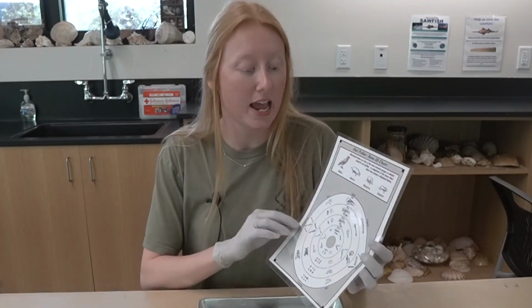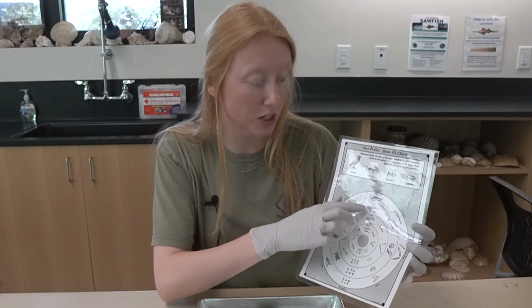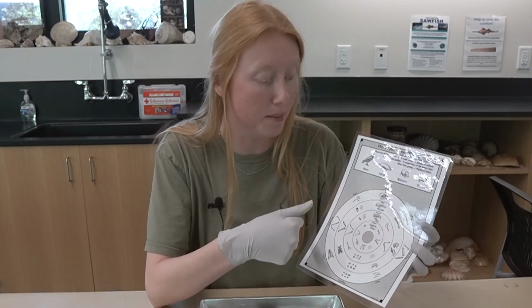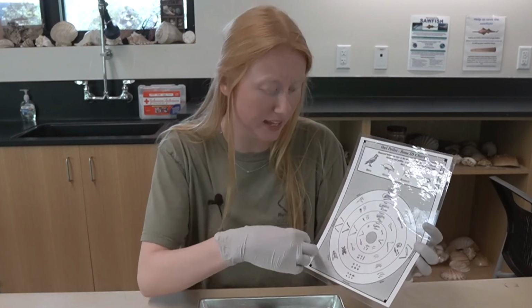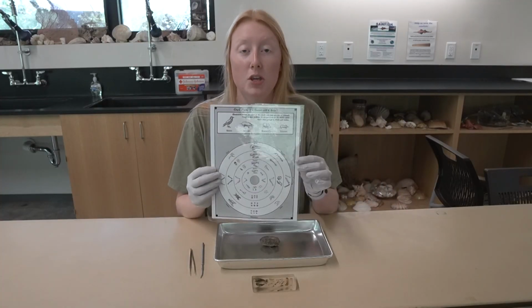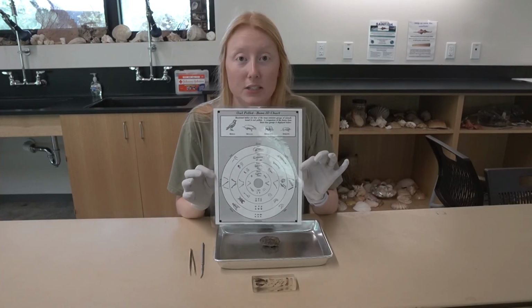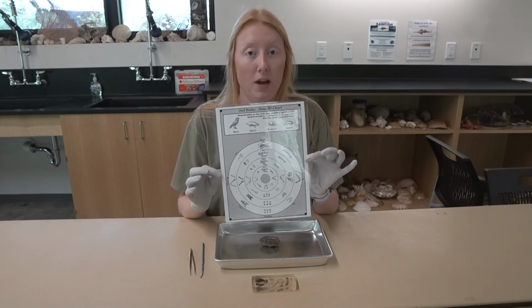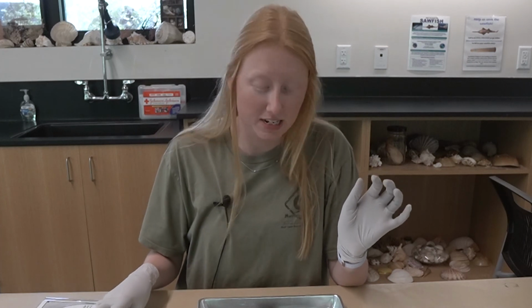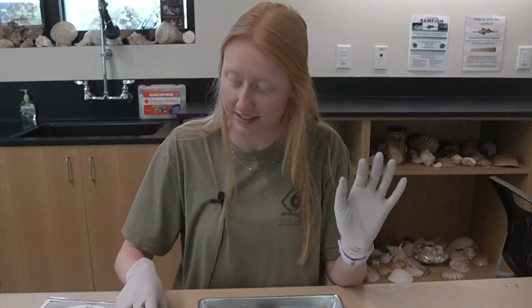Our bone ID chart has different types of skulls from birds, moles, rodents, and shrews. And then you have skulls, scapulas, front legs, hind legs, feet, ribs, anything you can think of. You will be able to put it on this little chart just to get a good idea of what your particular owl ate. So now we're gonna try and break into this pellet.